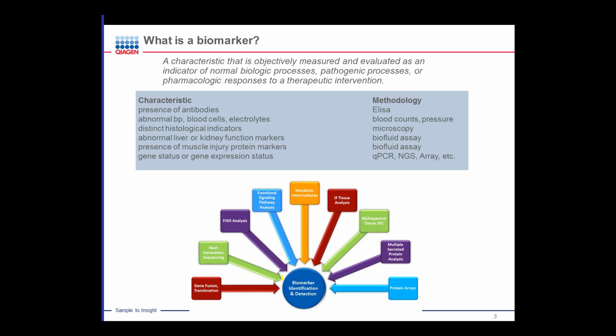And the methodologies that are used to quantify these changes are typically real-time PCR-based, next-gen sequencing-based, or hybridization array-based.